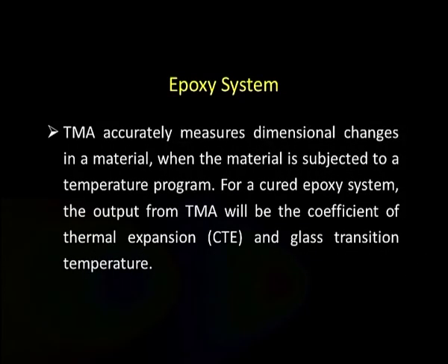For epoxy systems, we use TMA, which accurately measures dimensional changes in a material when the material is subjected to a temperature program. For a cured epoxy system, the output from TMA will be the coefficient of thermal expansion and glass transition temperature.